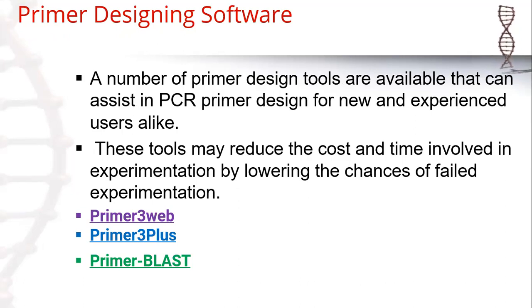And here we see what we have to know about the tools that we can use for primer designing. A number of primer designing tools are available that can assist in PCR primer designing for new and experienced users. These tools may reduce the cost and time involved in experimentation by lowering the chances of failed experiments. Some of the most used tools are mentioned here.